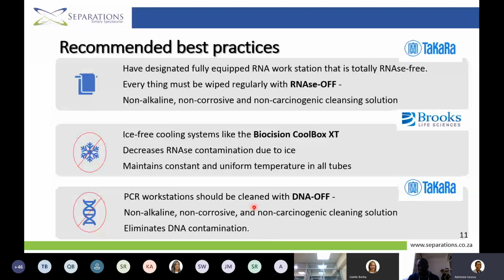And finally, we also recommend that if you really want to take it to the next level, you choose to work ice-free, because sometimes, especially when you're trying to isolate RNA, you could get RNase contamination, not from yourself or anything else, but coming from the ice.